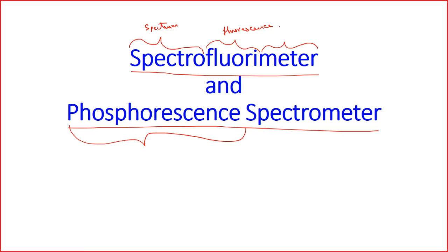Over here also, you can make a similar arrangement where your UV comes from the top, you put a small section of the gel there, and at 90 degrees you arrange things so that the fluorescence comes to the imaging system. Then you will be able to measure the fluorescence using your homemade device also.